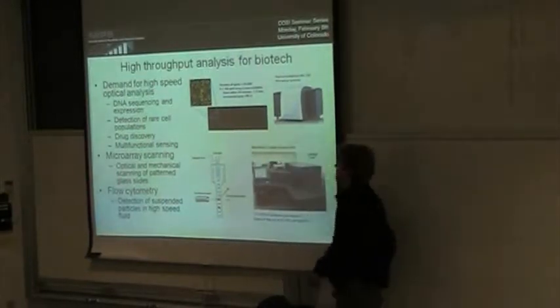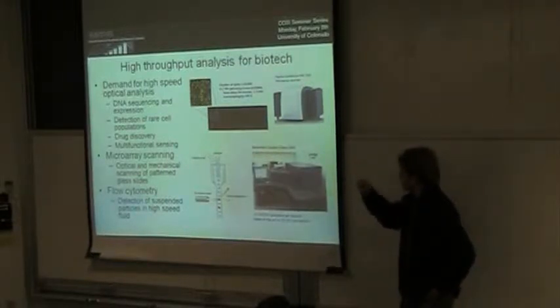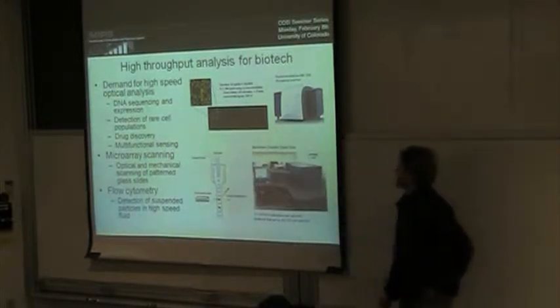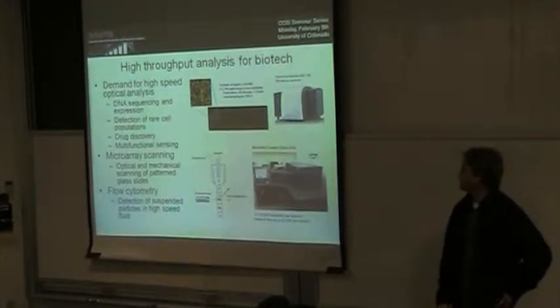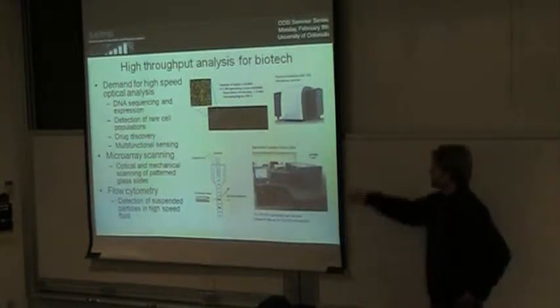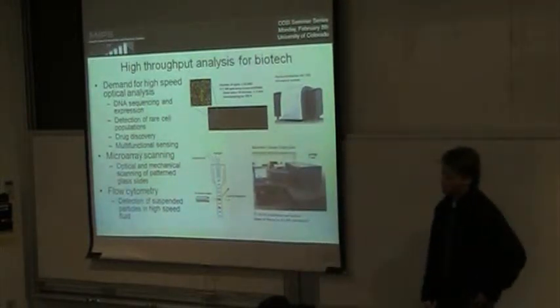The microarray scanner is just a scanning microscope that reads out the dots, scanned optically and mechanically. There can be anywhere from tens of thousands of those dots, and the density can be as large as a couple million. In the case of a couple million, you have a dot every 20 microns or so. It will take maybe a couple to 30 minutes to read this entire slide, which has all this data on it. So that's a popular technology.